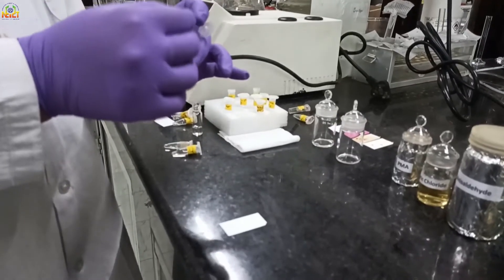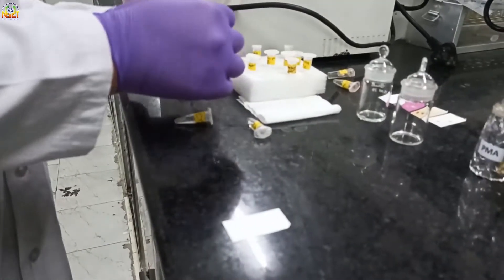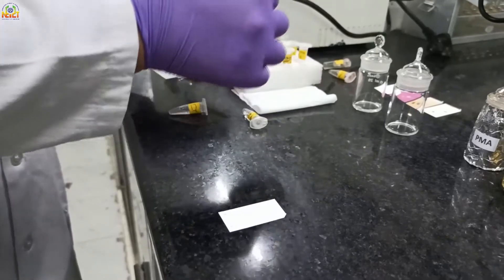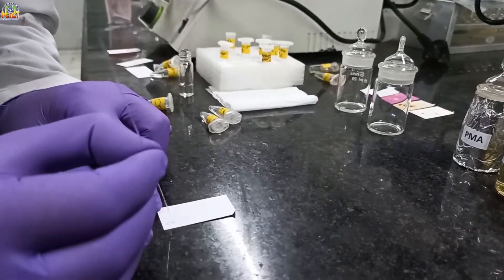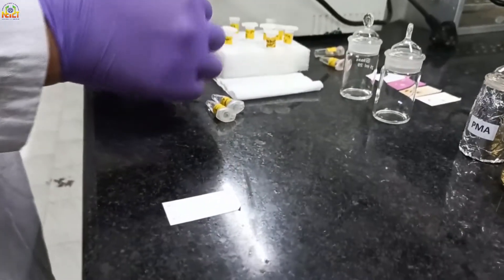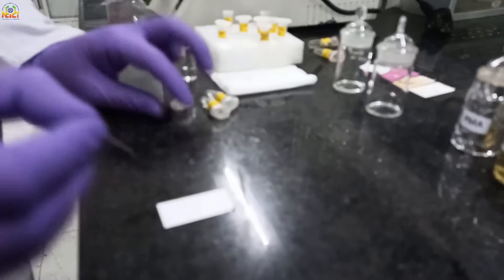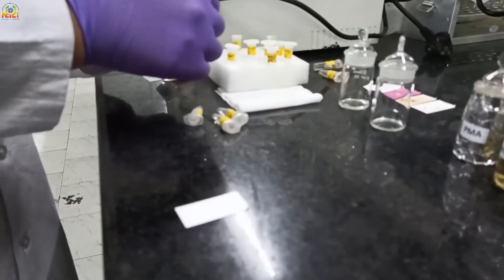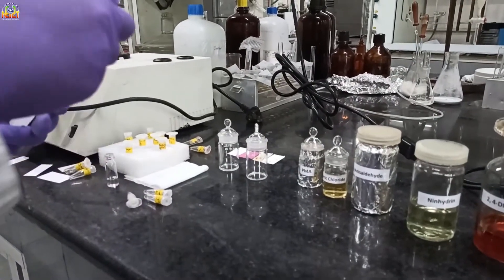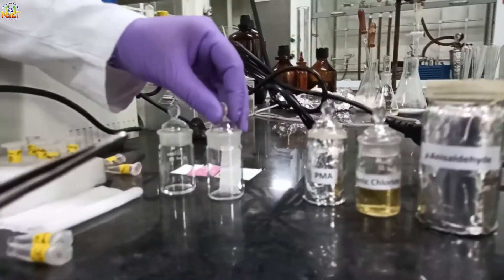Now I am again spotting the TLC for another stain. While using these stains, you have to wear gloves, because some stains are very acidic and some cause staining on your skin, like ninhydrin. Make sure to read the safety data sheet before using all the stains.